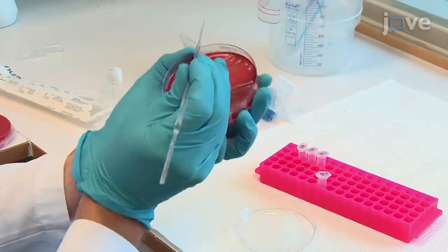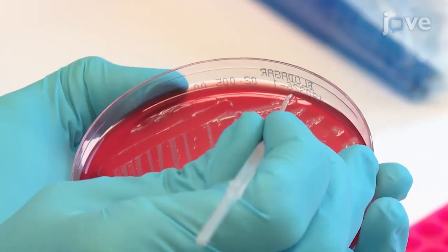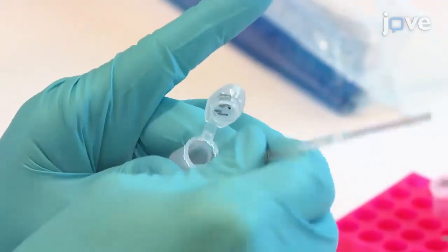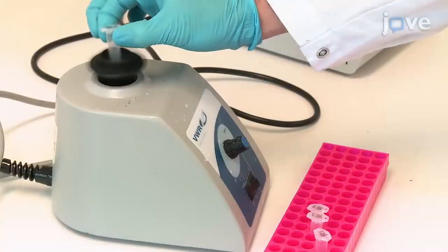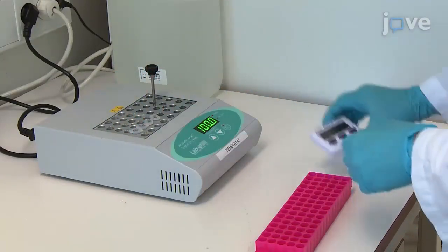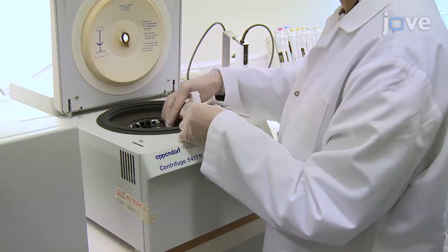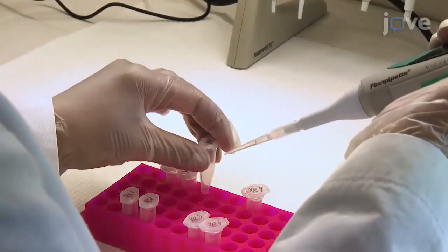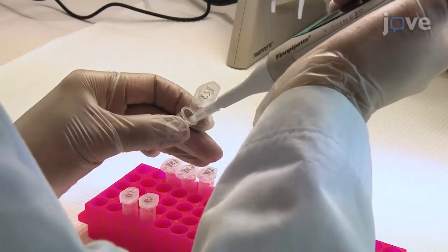After that, using inoculation loops, pick a single representative colony from each petri dish and transfer to 1.5 milliliter centrifuge tubes containing 50 microliters of ultra-purified water to re-suspend. Vortex briefly and incubate for 7 minutes on a heating block at 100 degrees Celsius. Then centrifuge at 16,000 G for 3 minutes and use a pipette to carefully transfer the supernatant template DNA into empty 1.5 milliliter centrifuge tubes.